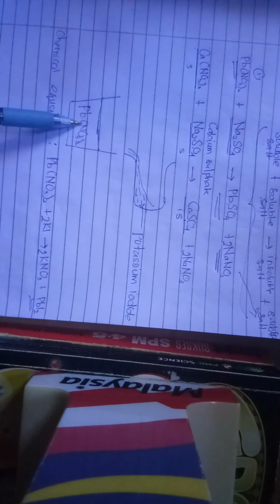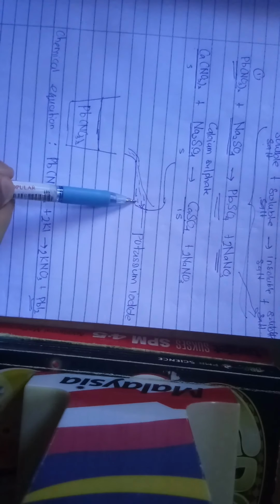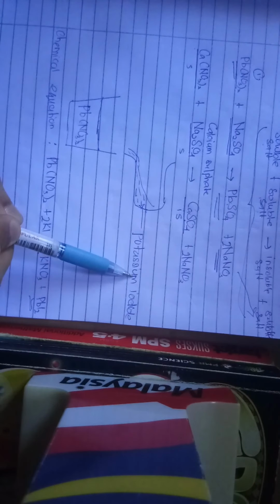So this is my insoluble salt. Here I put my soluble salts, lead nitrate. How do I know it is soluble? All nitrates are soluble, and potassium iodide is soluble. Why? Because potassium is group 1, and all group 1 salts are soluble.